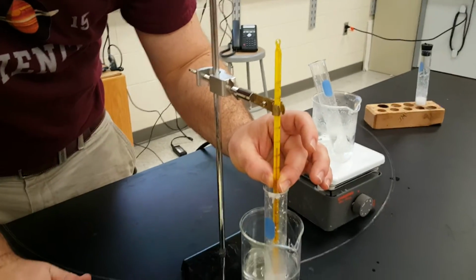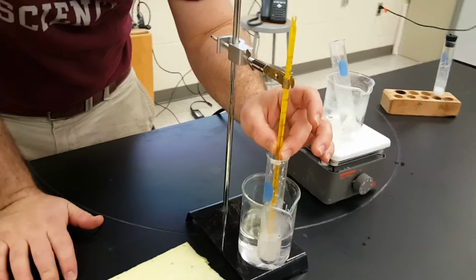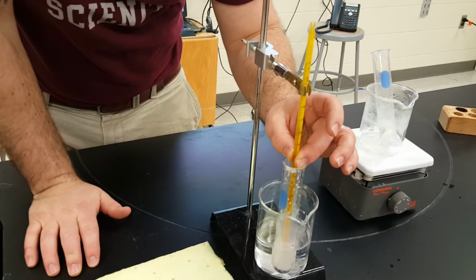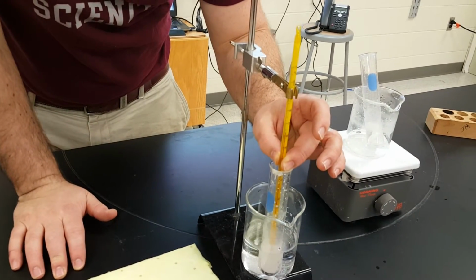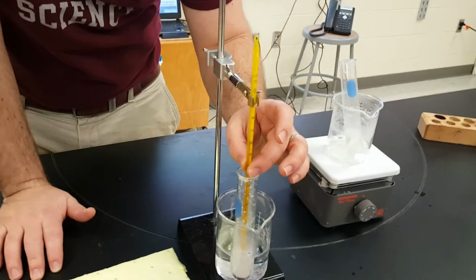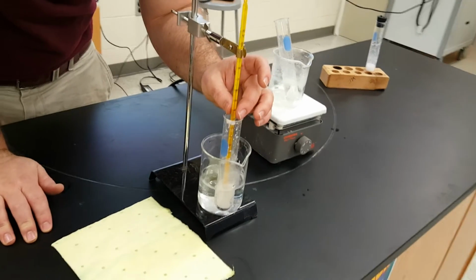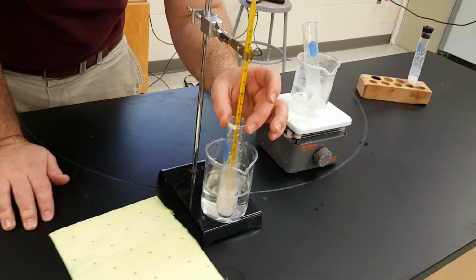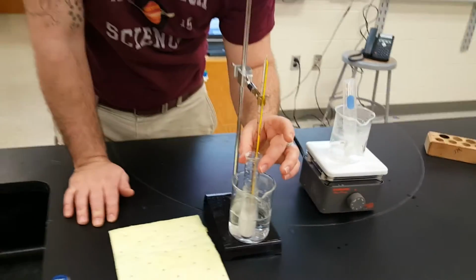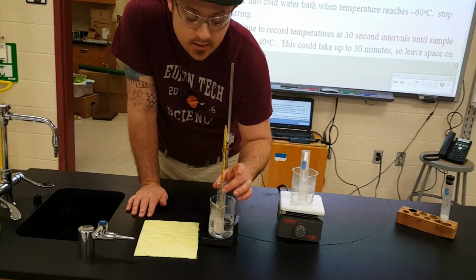Right. Now the main reason why we're going to do this is it's a wax, and you're going to eventually not be able to stir it anymore without breaking the thermometer. That's why we want you to stop stirring once it gets down to about 60, because that's getting close to the freezing point. Hint, hint. It's not the freezing point, but it's getting close to it. Right. So at that point, with the cold water bath, it'll speed things up a little bit, and your thermometer will quickly get locked into place, which is why it's in a thermometer stand.